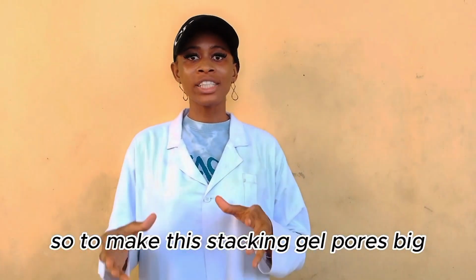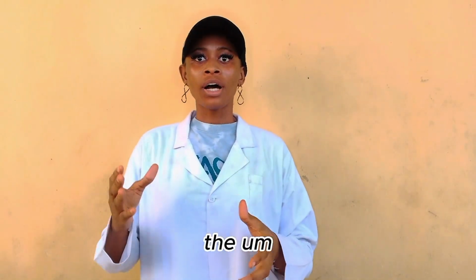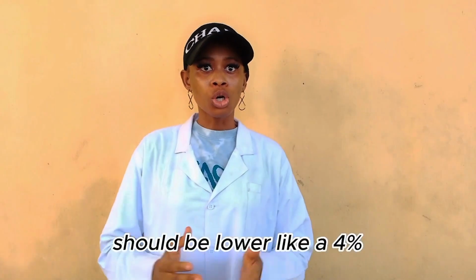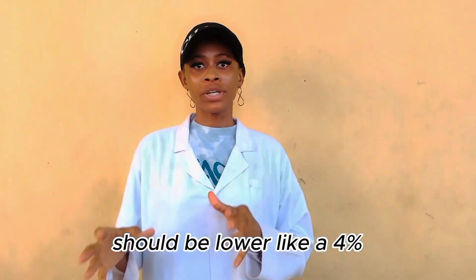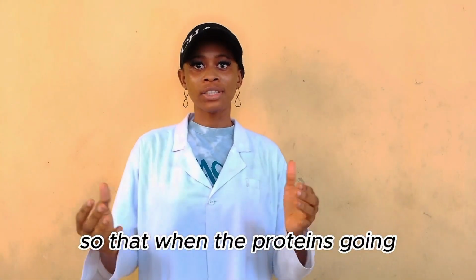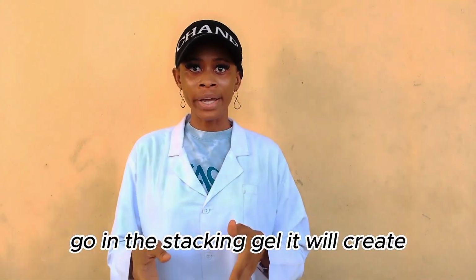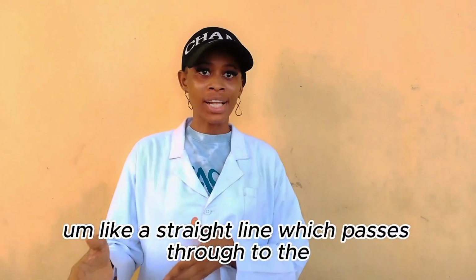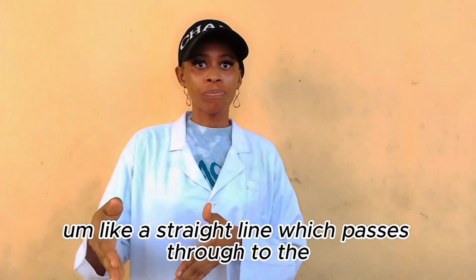To make these pores big, the concentration of the acrylamide used in making this gel should be lower, like a 4% acrylamide, so that when the proteins go in the stacking gel, it will create a straight line which passes through to the separating gel.